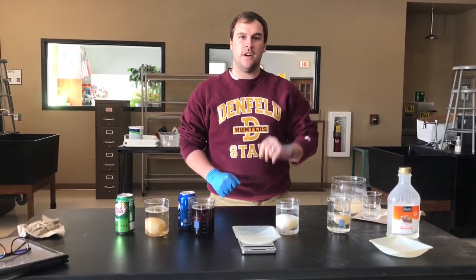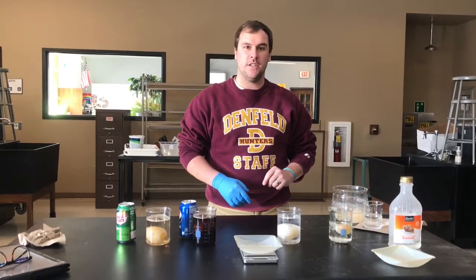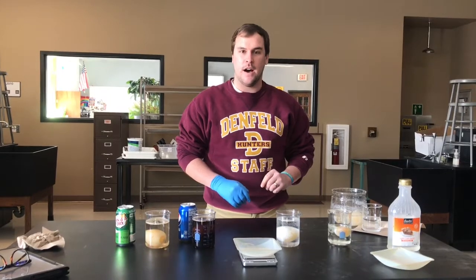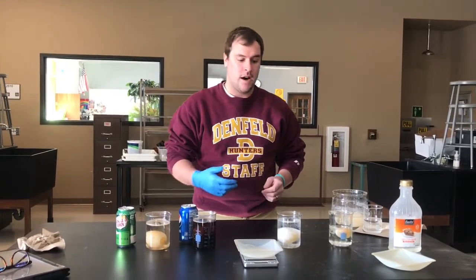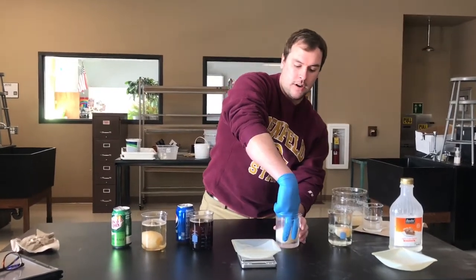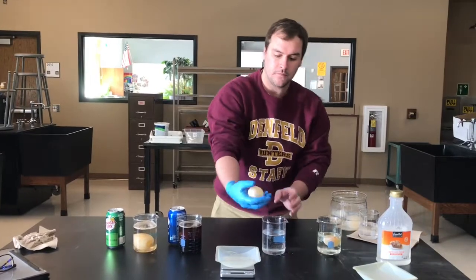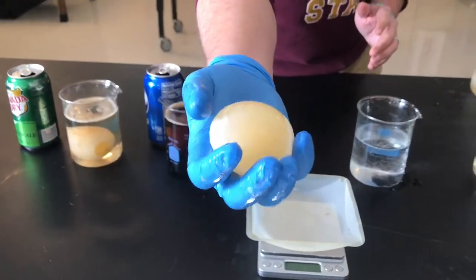This is day 2 of the Egg Osmosis Lab. Yesterday we put our eggs in our solutions, and today we are going to take them out and measure them. Just wanted to show you a couple of the eggs, so let me show you. Here's our egg in the water, and again we are going to measure them. So as you can see, there is a cool change, how it just kind of blew up a little bit.